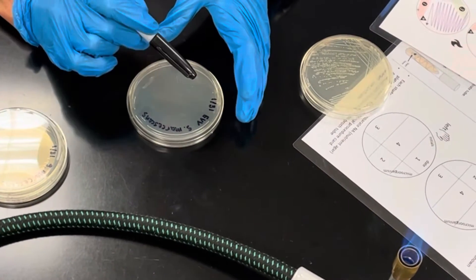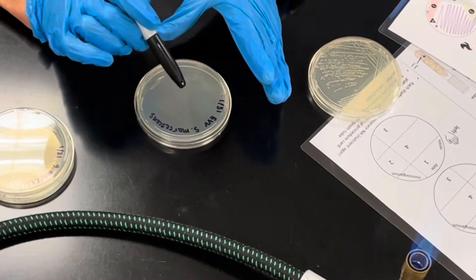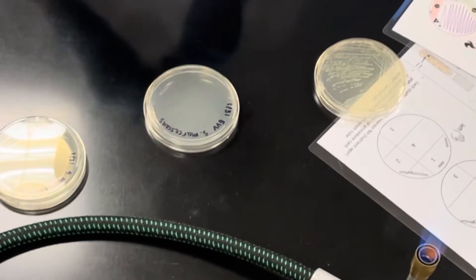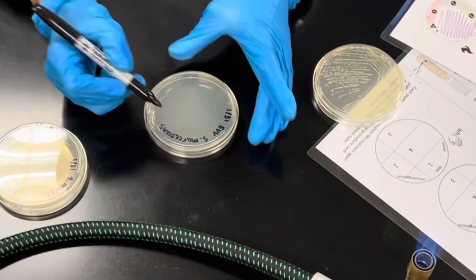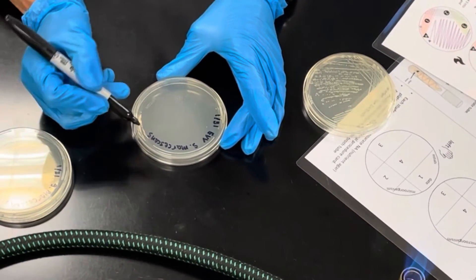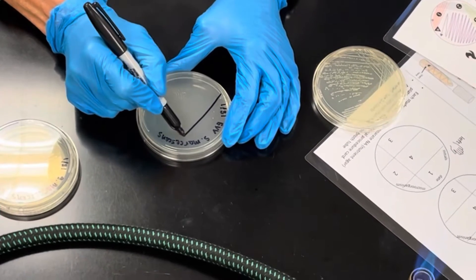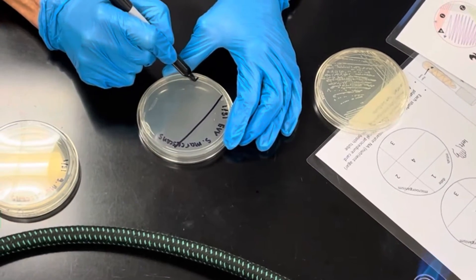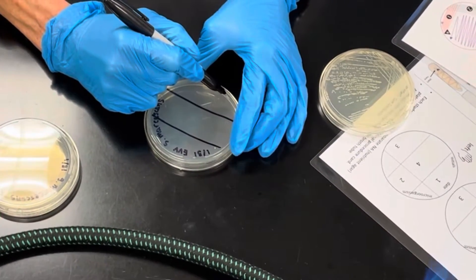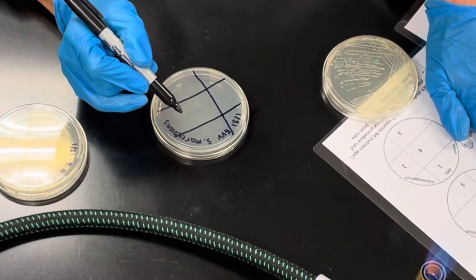When learning, it's sometimes nice to make lines because we're going to be streaking across this plate and dividing it into quadrants. Students sometimes need lines so they know their boundaries. If you're right-handed, divide your plate roughly into thirds — these lines don't have to be perfect but make them as straight as possible — about a third across the plate each way.